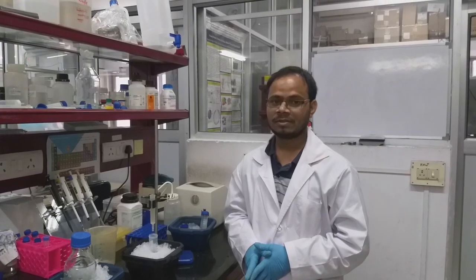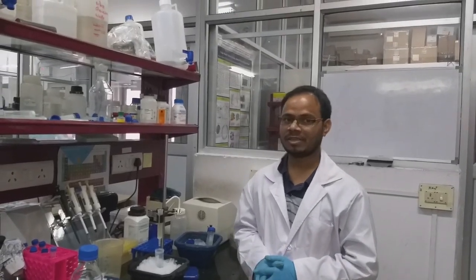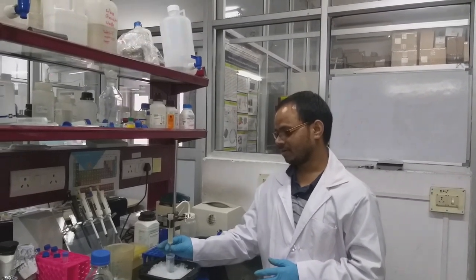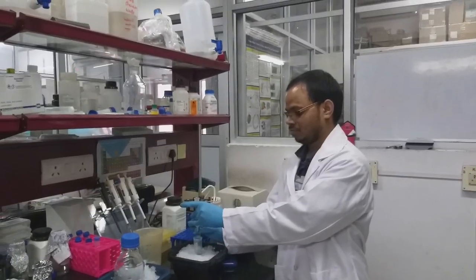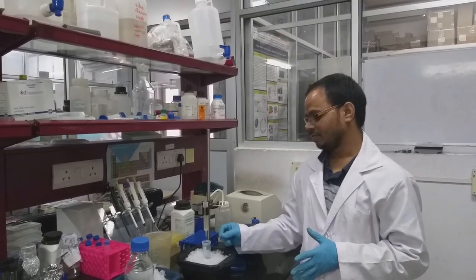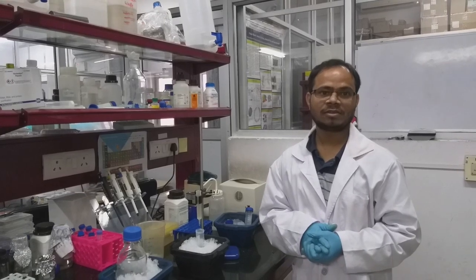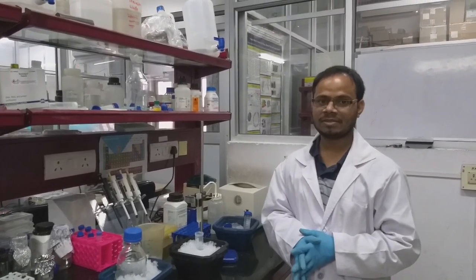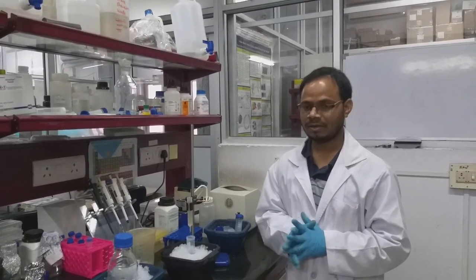After incubation with beads, we have to follow another 3 steps to get the purification completely done. First, after the beads are taken out from ice, you have to remove the outlet so that all the flow through other than beads will be taken out. The next step is we have to wash with the equilibration buffer, and the third step is we have to elute the protein, the His-tagged protein, using imidazole containing buffer.